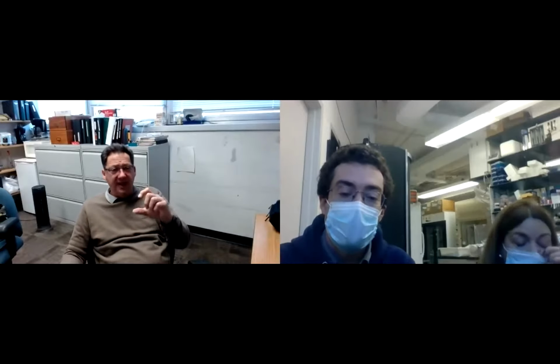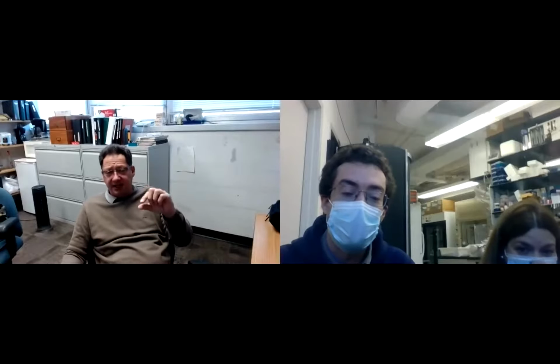So maybe you should also add, it's not unique to filaments, but there is also the question of ice thickness. The ice has to be thin, but not so thin that part of your filament gets onto the air-water interface. And I think you can recognize when that happens, because the microtubules just don't look well, right?